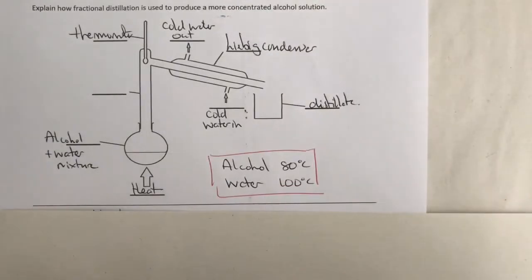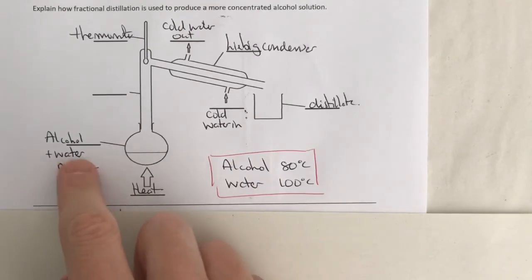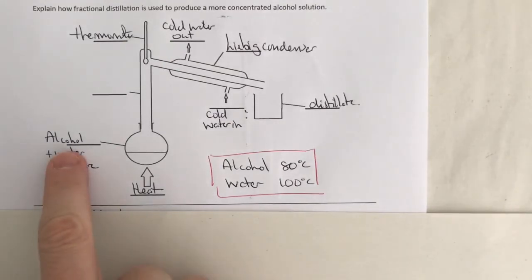Okay, in this video we're going to have a look at how we use fractional distillation in order to increase the concentration of the alcohol that could be produced from fermentation. What they do is take the alcohol-water mixture, because the alcohol produced in fermentation will contain water, and that's where we have to get rid of the water. If you get rid of the water, we increase the concentration of the alcohol.